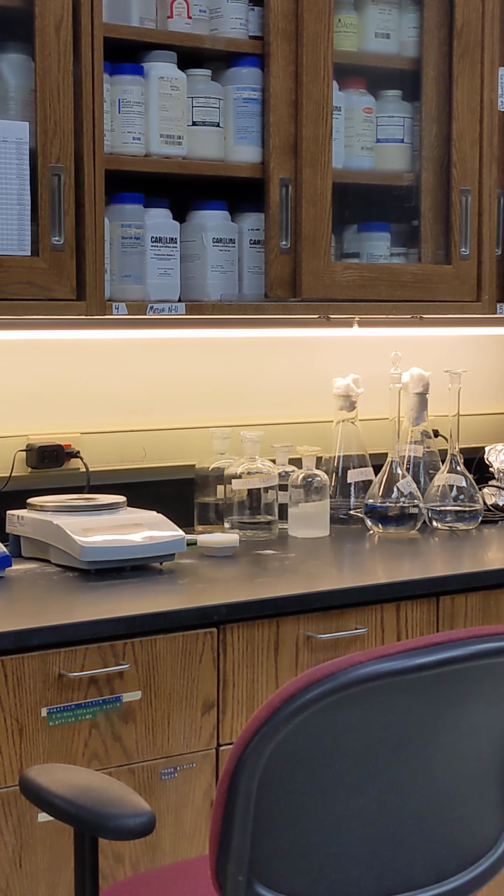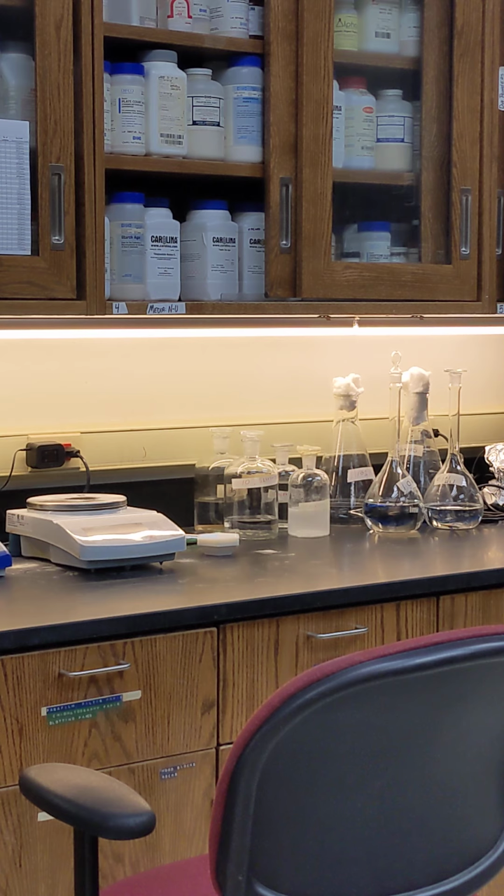Normally I'll be over at Waukesha, but this is my home base, so I'm going to do some of my videos from here when I'm prepping other things. So in your lab manual for lab 1, you have this section on media preparation.